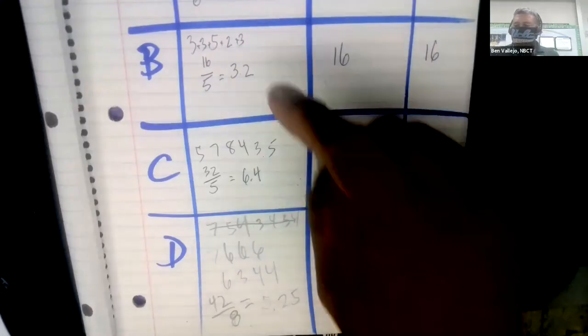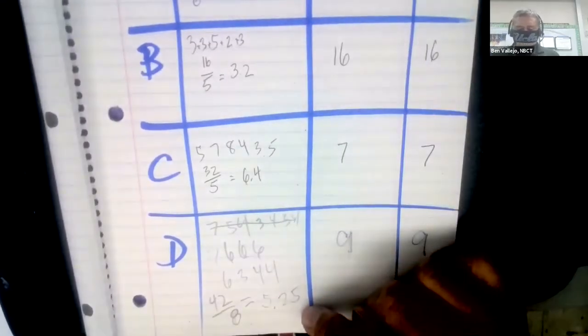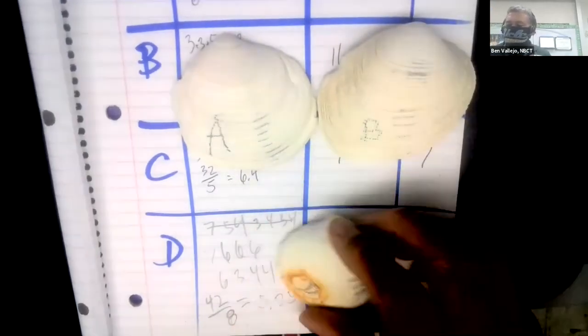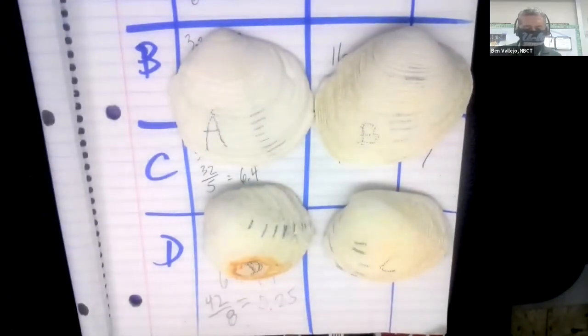So obviously, if you take a look at it, the average width was not the same. Okay. And let's see, the bigger ones, there's letter A, and here's letter B. The bigger ones seem to be, not surprisingly, these guys had more bands, A and B did, than C and D.